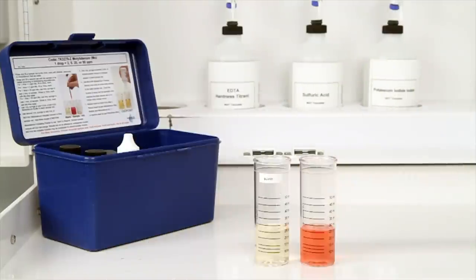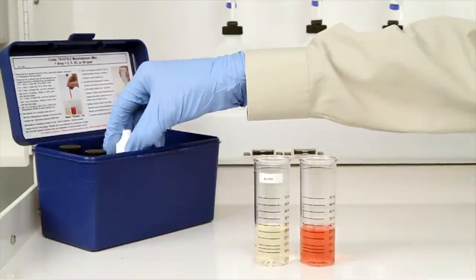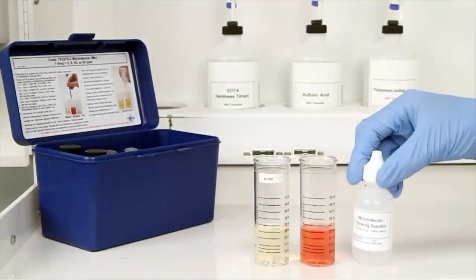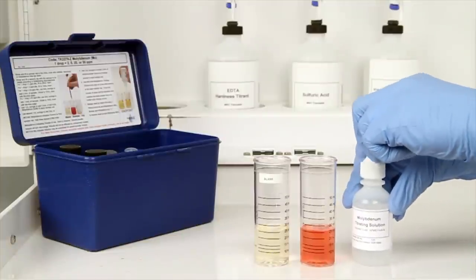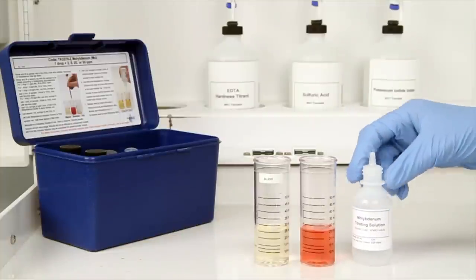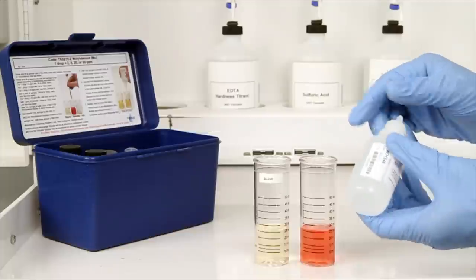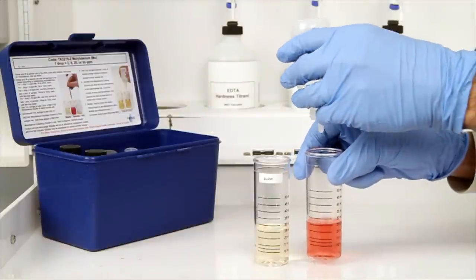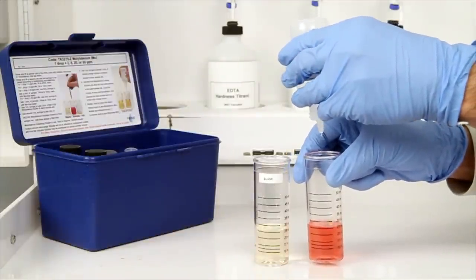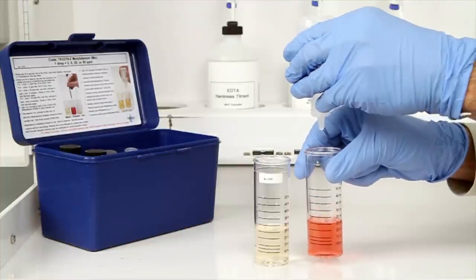The next step according to the endpoint ID procedure is to perform the titration. It's important to make sure you have the proper titrant and the proper sample size for this titration. Add the molybdenum titrating solution one drop at a time to the vial containing your sample. Count the number of drops during this step.